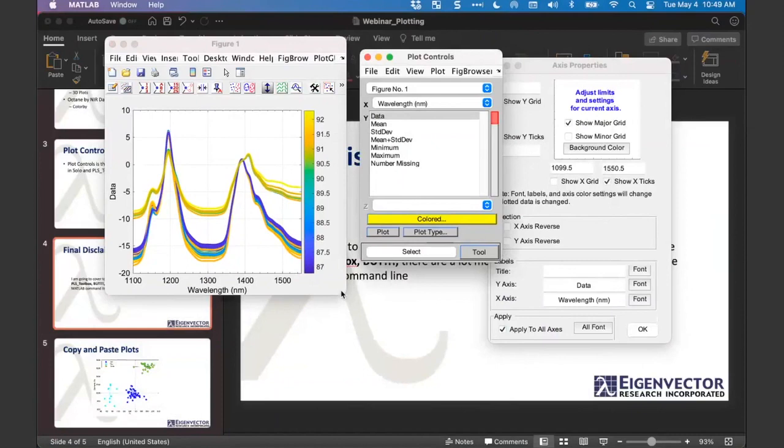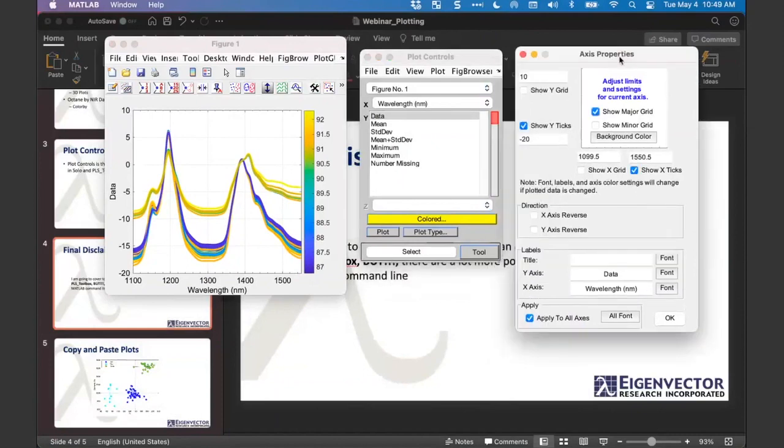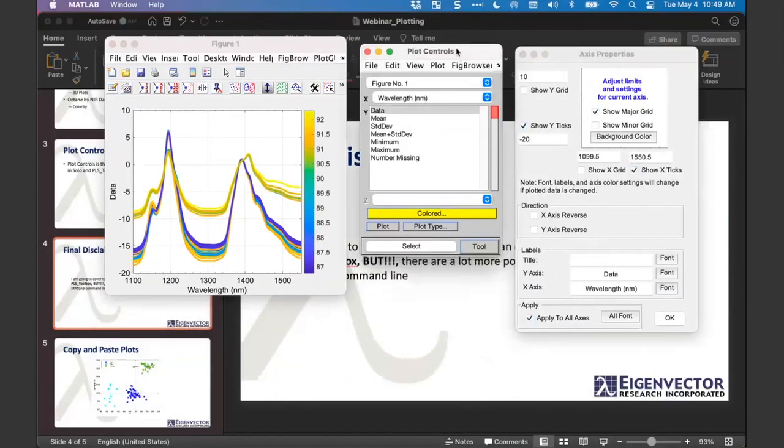And also the nice thing is then you could change all the labels on there to words if you wanted. I use that some, but again, that's a dive a little deeper kind of thing. And it's not available in Solo. That's the thing to keep in mind.